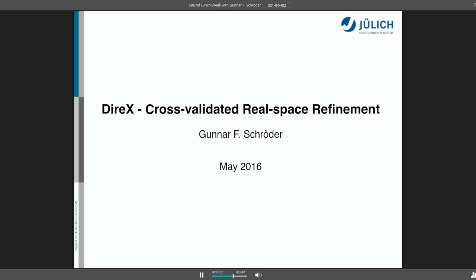I will be talking about DireX, basically the program that's been developed in my group for the last few years. It does real space refinement, and it was initially meant to work for low resolution maps.